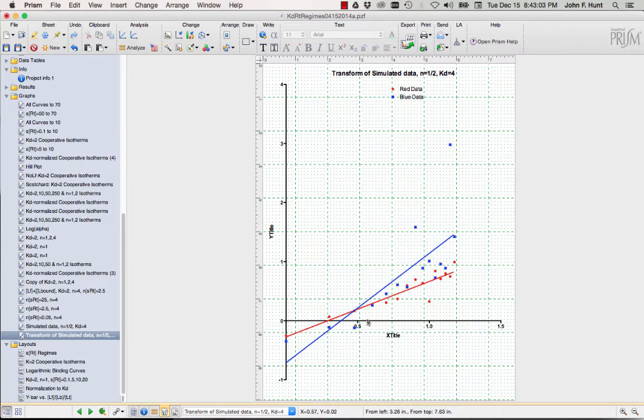And if I were to do it by hand, what I would do is actually use the most probable estimate of the baseline value that came from the nonlinear curve fitting. Because, of course, the first point in the graph, or the lowest point in the graph, might have noise in it, and that is not likely to be the best estimate of the baseline. The curve fitting gives you the most probable estimate of the baseline according to your error model.